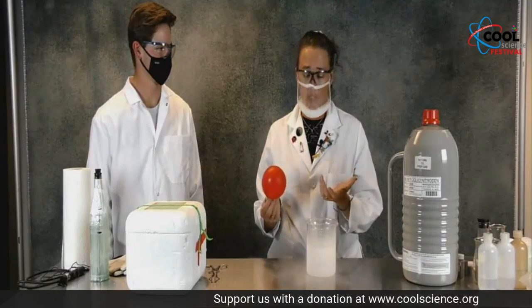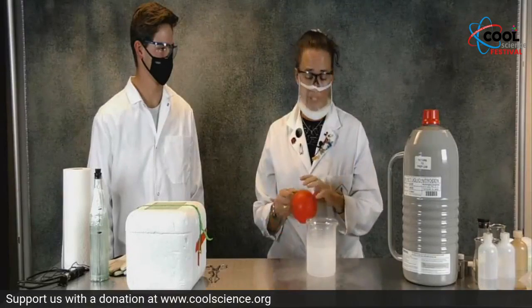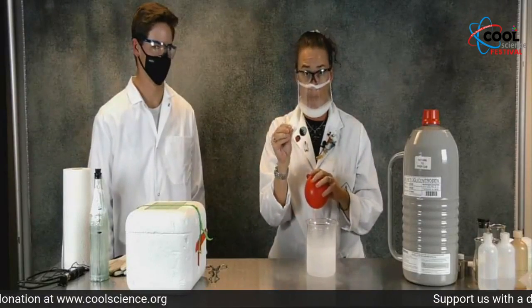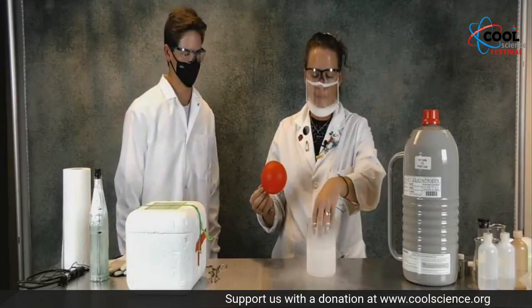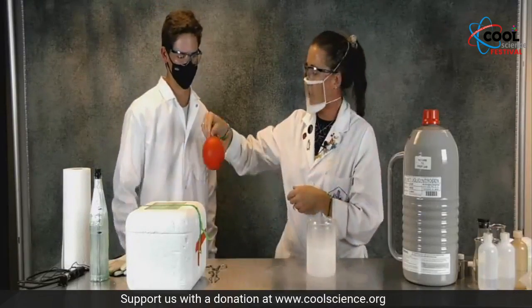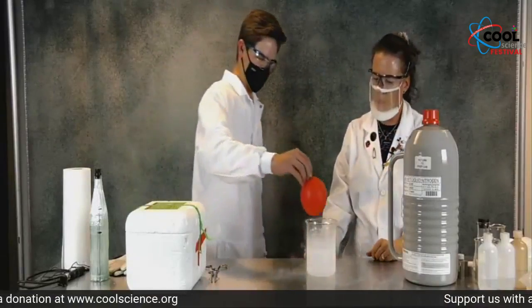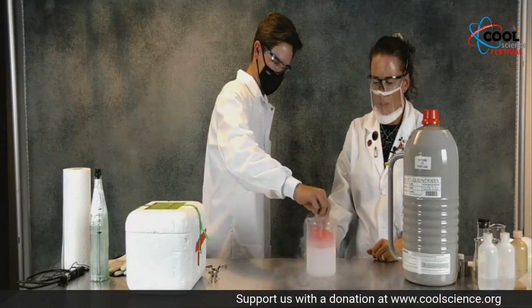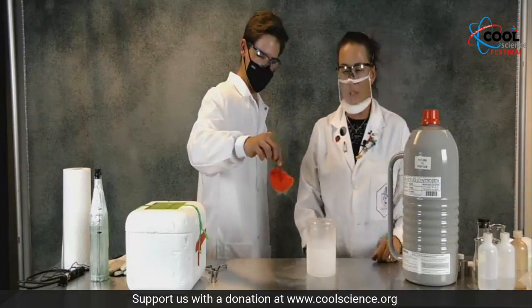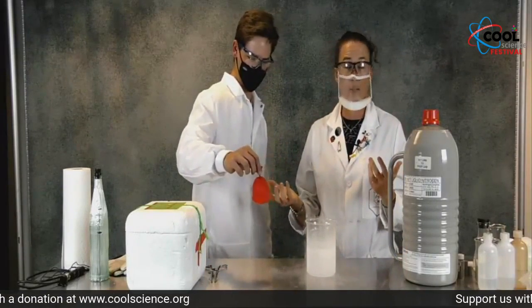What happens to molecules when they get really cold? Now, if anyone knows, absolute zero is minus 273.15 degrees Celsius, or zero Kelvin. That's where all molecules are supposed to stop moving. We're not going to get that cold because it's heating up, the temperature is warming up. We're going to take this balloon and show you what happens when molecules start to get really cold. So as Connor's lowering it in there, the balloon is completely changing. All the gas looks like it was gone and then comes back.